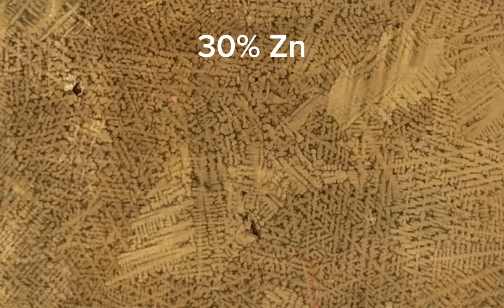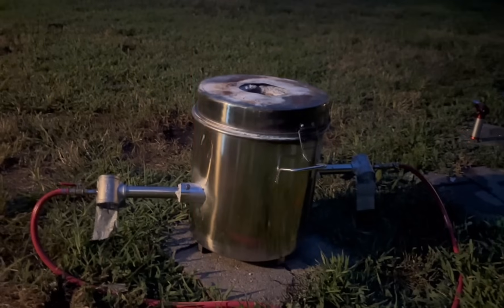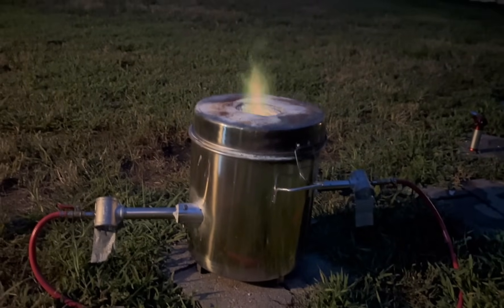I'm going to be using brass of a composition of about 30% zinc, 70% copper. I found that this composition gives the best dendrites. In here, I'm going to be pouring three ingots of this composition.